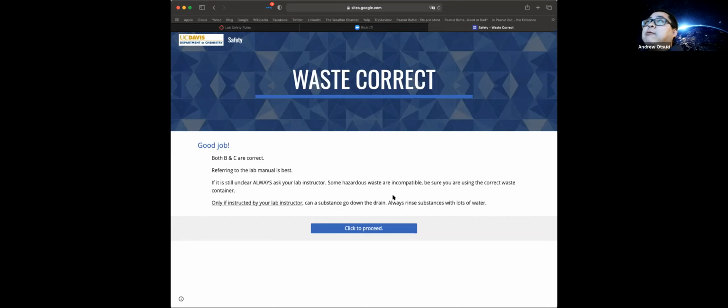If you ever have questions about lab waste, always refer to the manual or ask your TA. Don't just assume anything. That could be disastrous. So we do not want to assume anything in the chemistry lab. Okay.